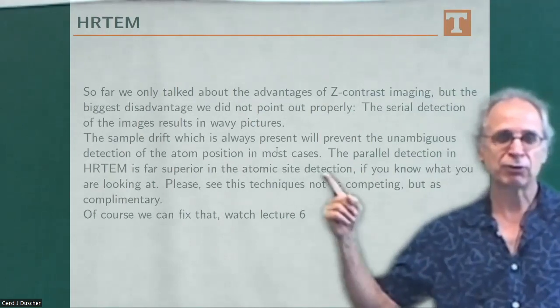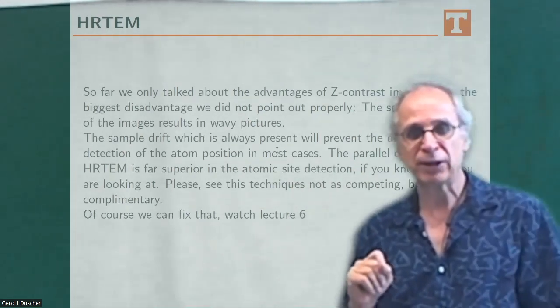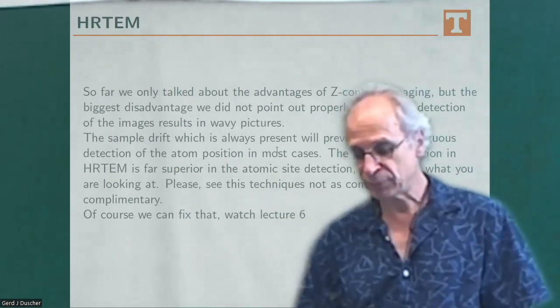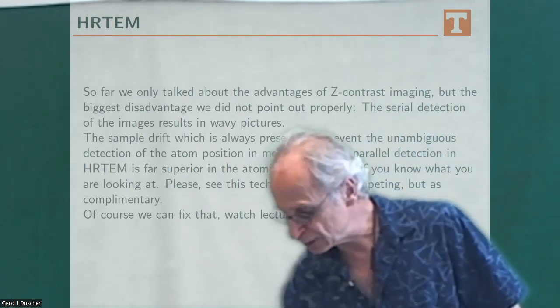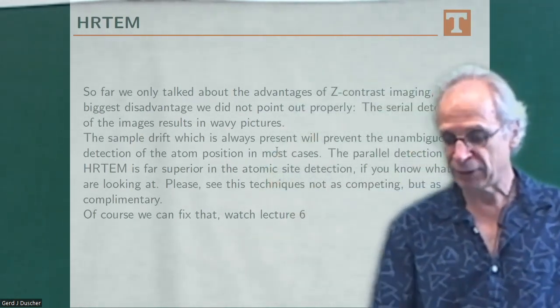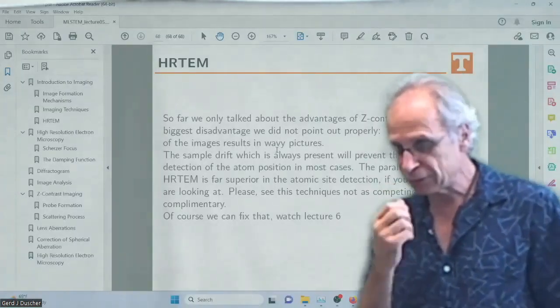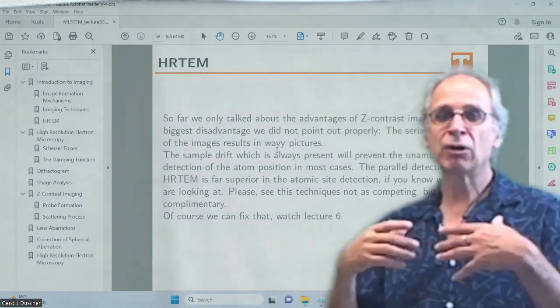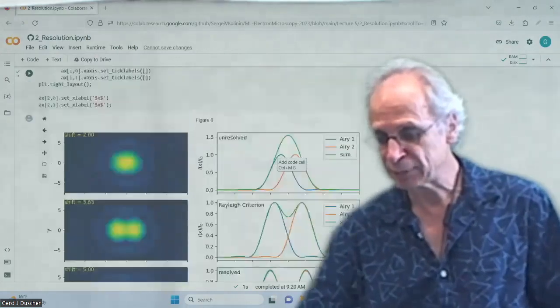Or you wait for the image stacks, that is in lecture 6, where we will talk about that, and then we do the strain analysis in STEM images. Okay, so this is the lecture part. I went through the aberrations relatively quickly because what we're gonna do now is we go through the whole thing again, but this time we're going through that.